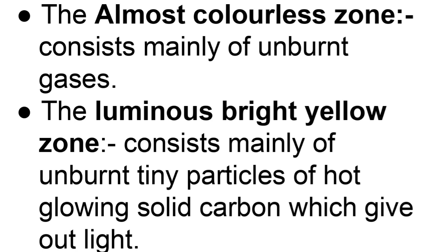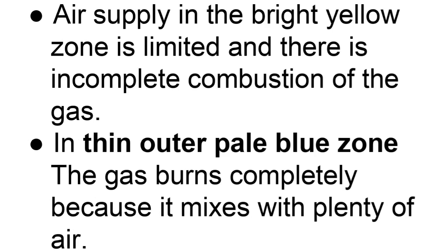The reason why they are unburned is because the air supply in the bright yellow zone is limited, and therefore there is incomplete combustion of the gas. Finally, we move on to the thin outer pale blue zone.